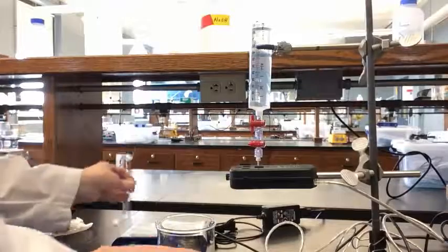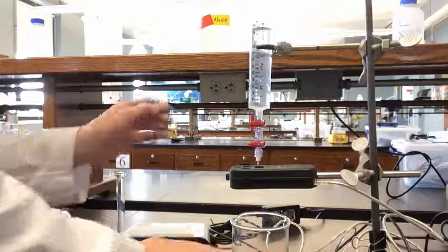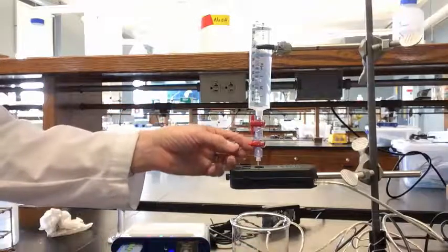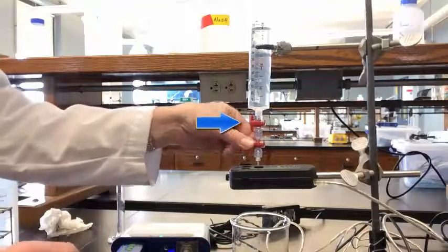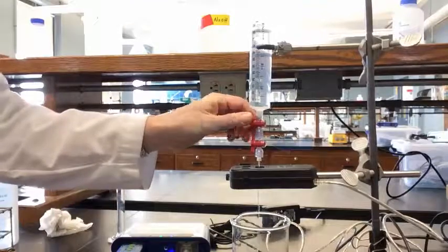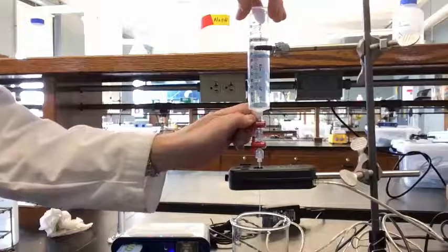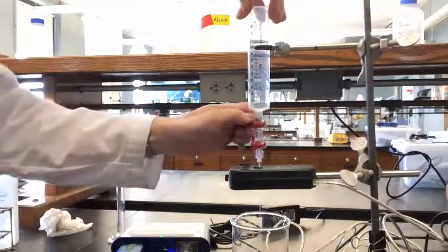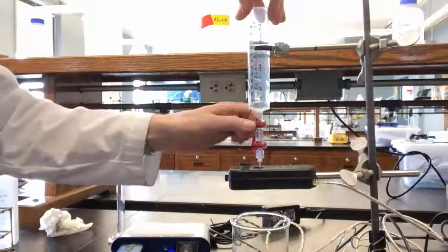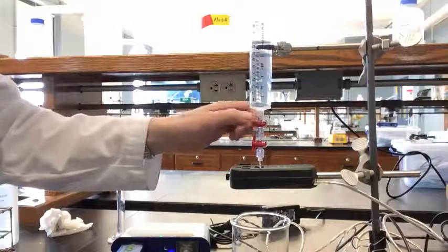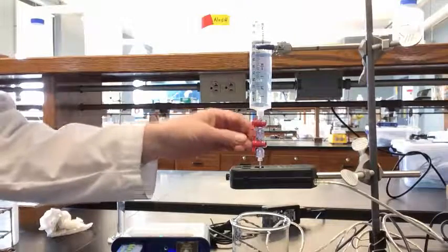There are two stop cocks on the drop counter. The top stop cock controls the drop rate and the bottom stop cock is only for turning the syringe on and off. Open the bottom stop cock all the way and then use the top stop cock to change the drop rate until it is about 1 to 2 drops per second.